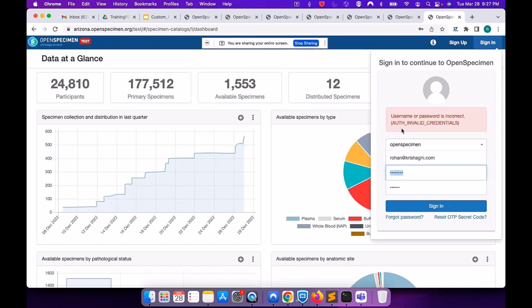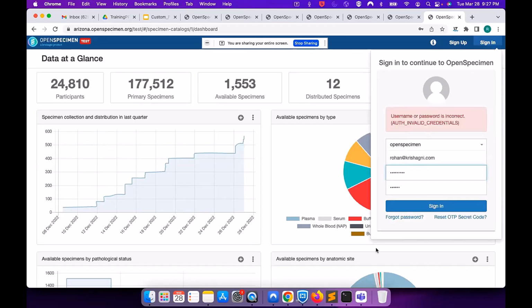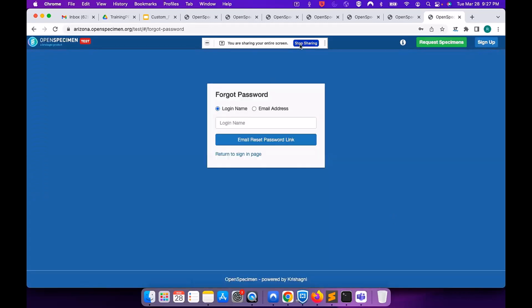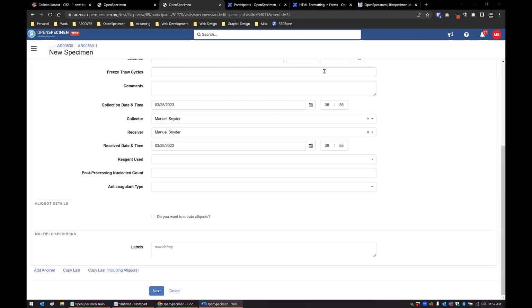No, I forgot it. If it's easier, I can share my screen. Yeah, please. Yeah. Okay.